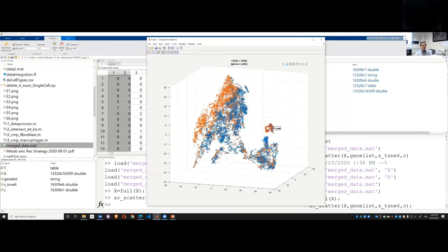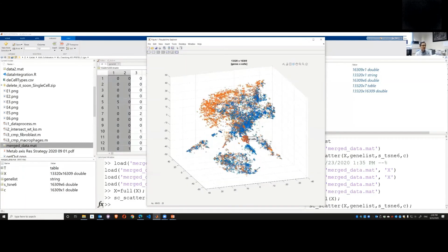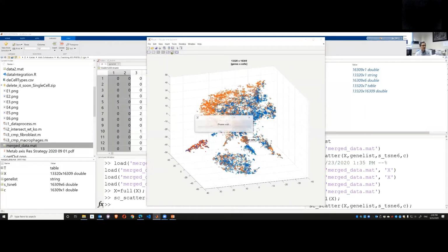So this is a special cell type. And we can try another group, see what cell type is there. So what I can do is select and drag this and say, okay, tell me using machine learning tool, this is my macrophages. So I can do this quick annotation of what cell types are within my sample.